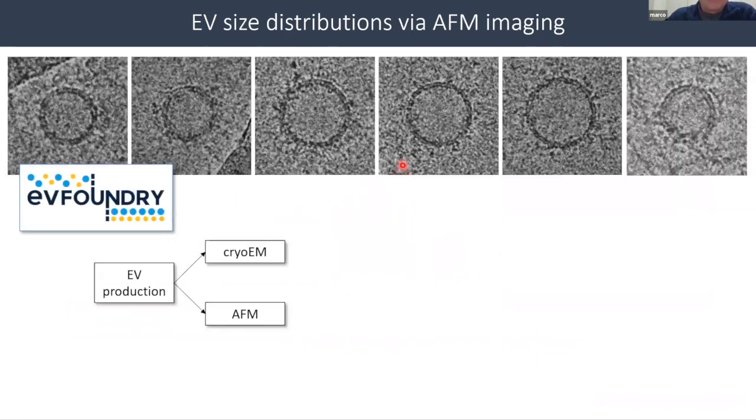Well, we had the luck of being in the consortium of a very nice European project coordinated by Professor Paolo Bergese. In particular, we had the opportunity of having these very same EV batches isolated by several labs and sent at the same time to the lab of Professor Debora Berti in Florence, who did cryo-EM on the vesicles, and the very same batch was also sent to us to do our AFM morphology on it.